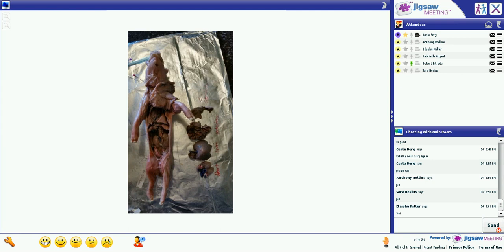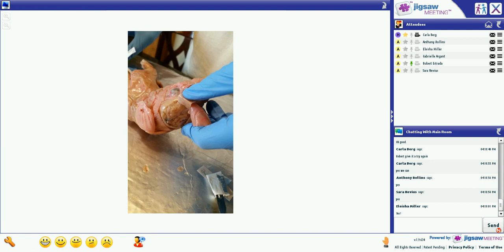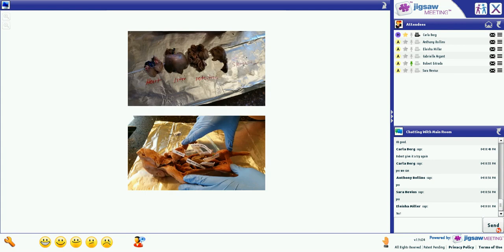And my mom, being a nurse that worked in the ER, loves this stuff, so she wanted to go further. I don't know if you guys got pictures on there, but we cut open the skull and we got to look at the brain, and there's the brain, and then we cut out the eye and got to look at part of the eyes too. I don't know if we have a picture of the eye on there or not. So yeah, that's the pig dissection. It's pretty fun, and my brother almost threw up. Okay, so there's no eye. But yeah, that was my dissection, and I hope you guys enjoyed that.